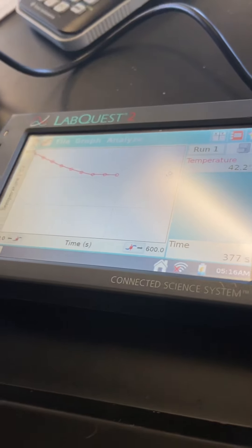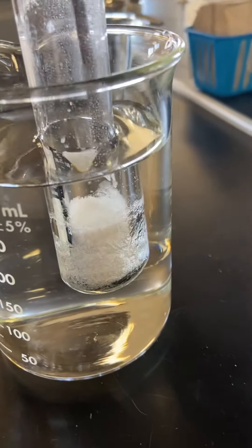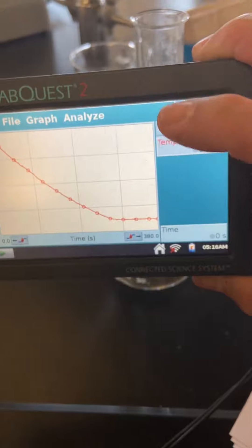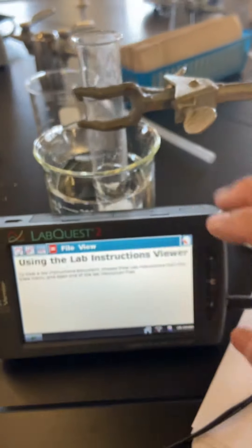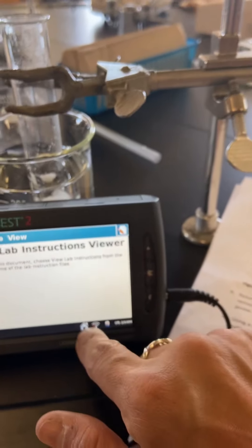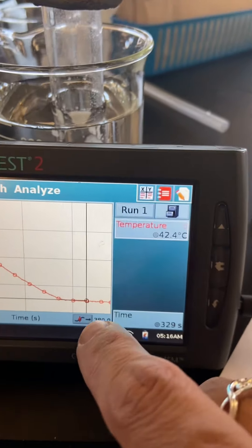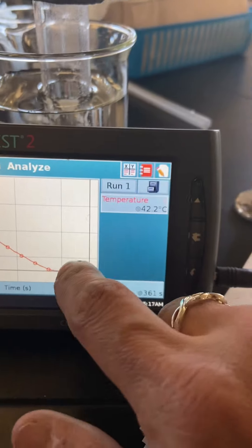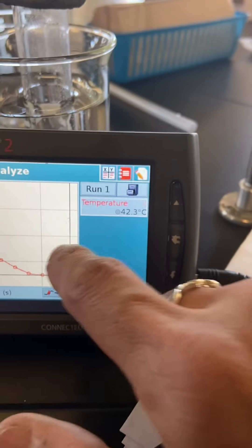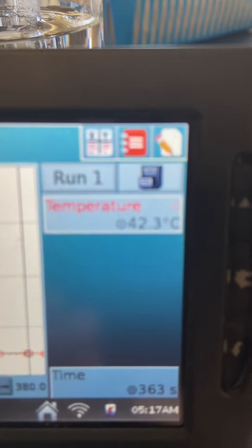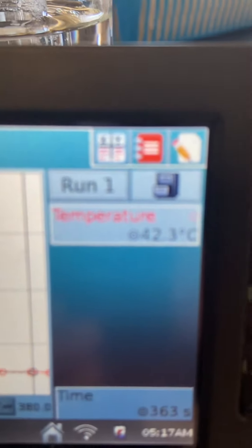So when you're ready to stop, just hit the stop button on the LabQuest. And here we have freezing point. What we can do is find that plateau and record the temperature, the freezing point of lauric acid, which is 42.3 degrees Celsius.